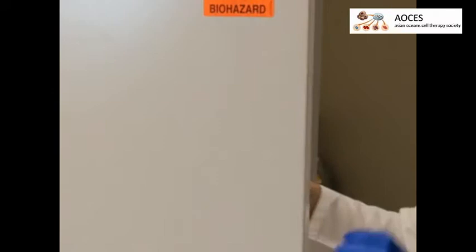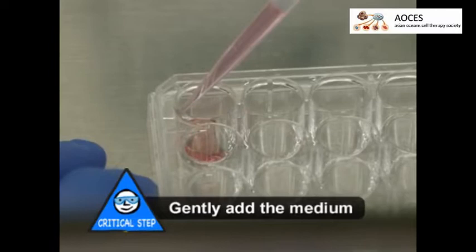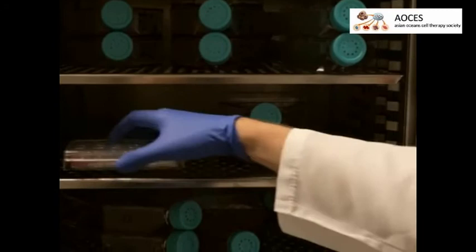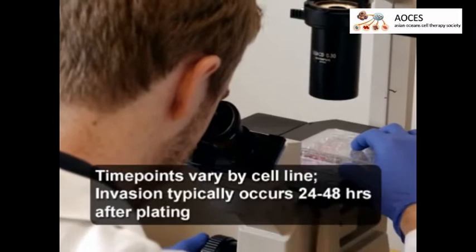Keeping the plate level, place it into a 37 degrees Celsius cell culture incubator and leave it undisturbed for 30 minutes. Once the 3D cultures have polymerized, slowly pipette 1 milliliter of warm cell culture medium into each well to submerge the culture. Then return the 3D cultures to the incubator.